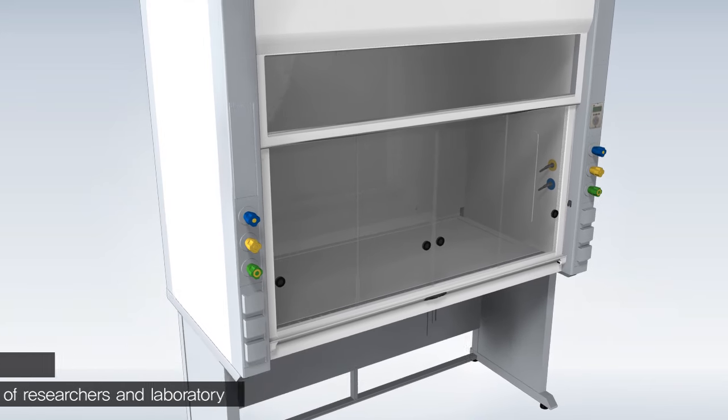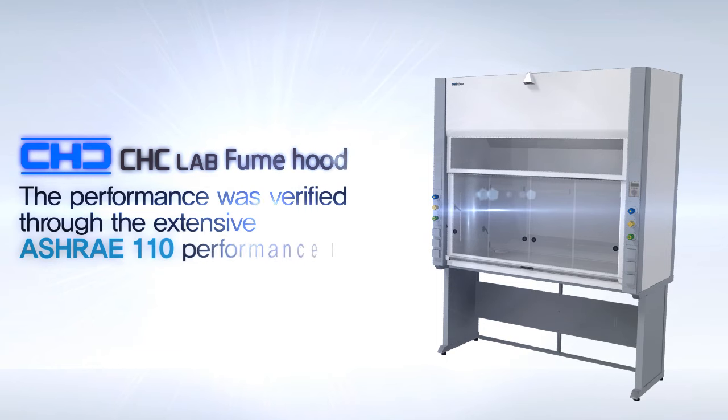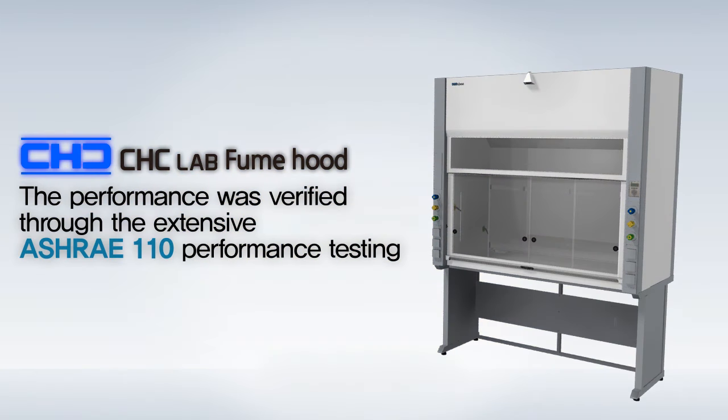The fume hood of the CHC Lab is manufactured with our optimal design and its performance is verified through extensive ASHRAE 110 performance testing.